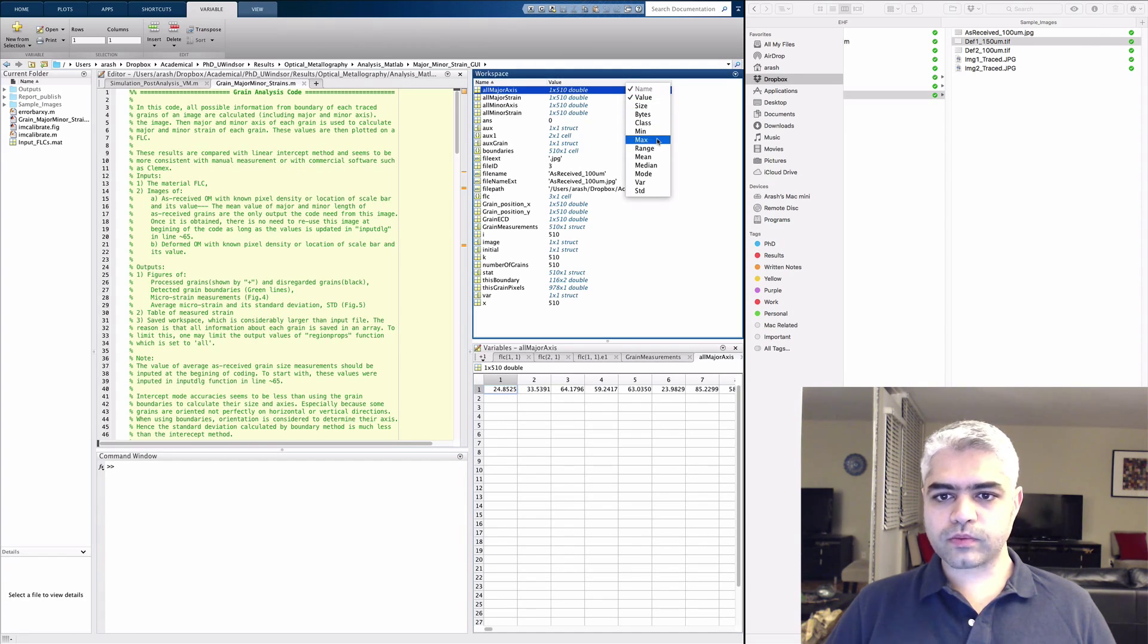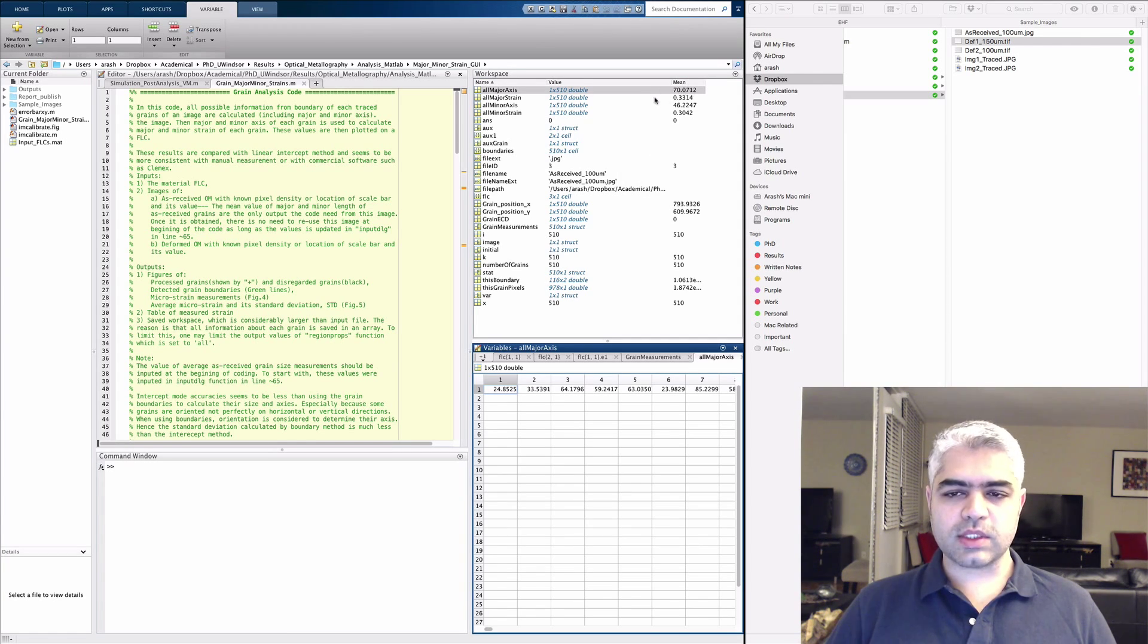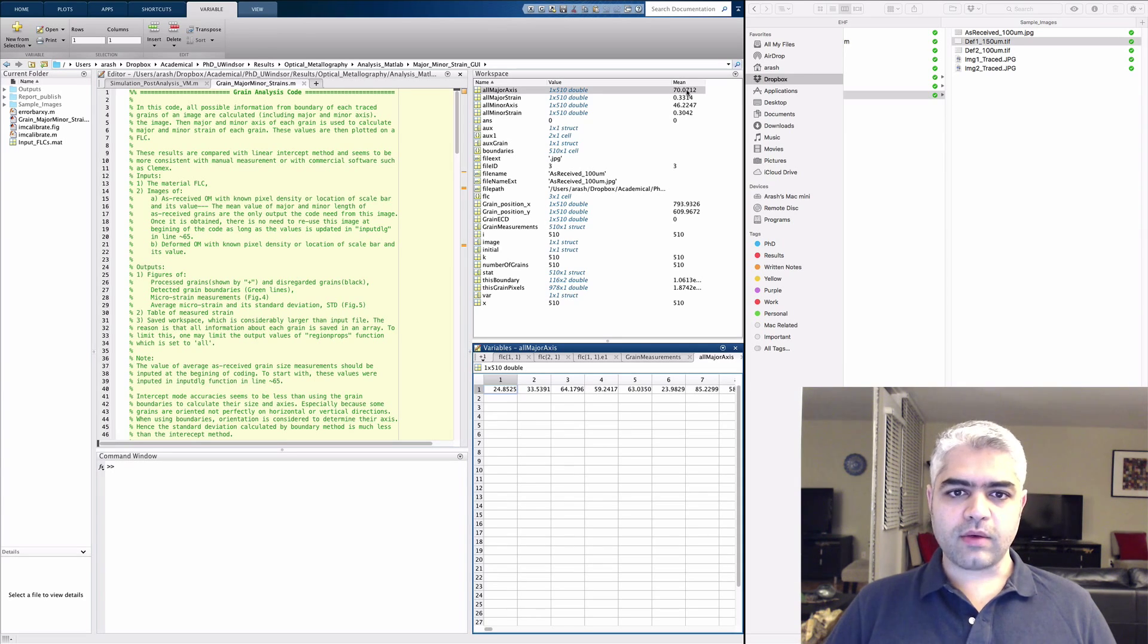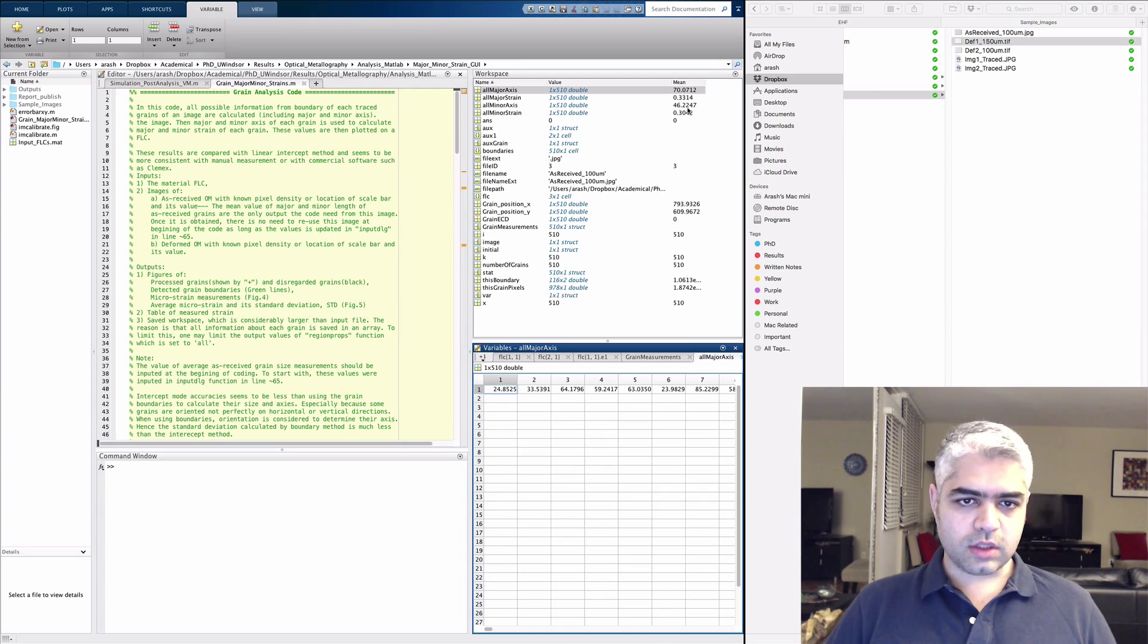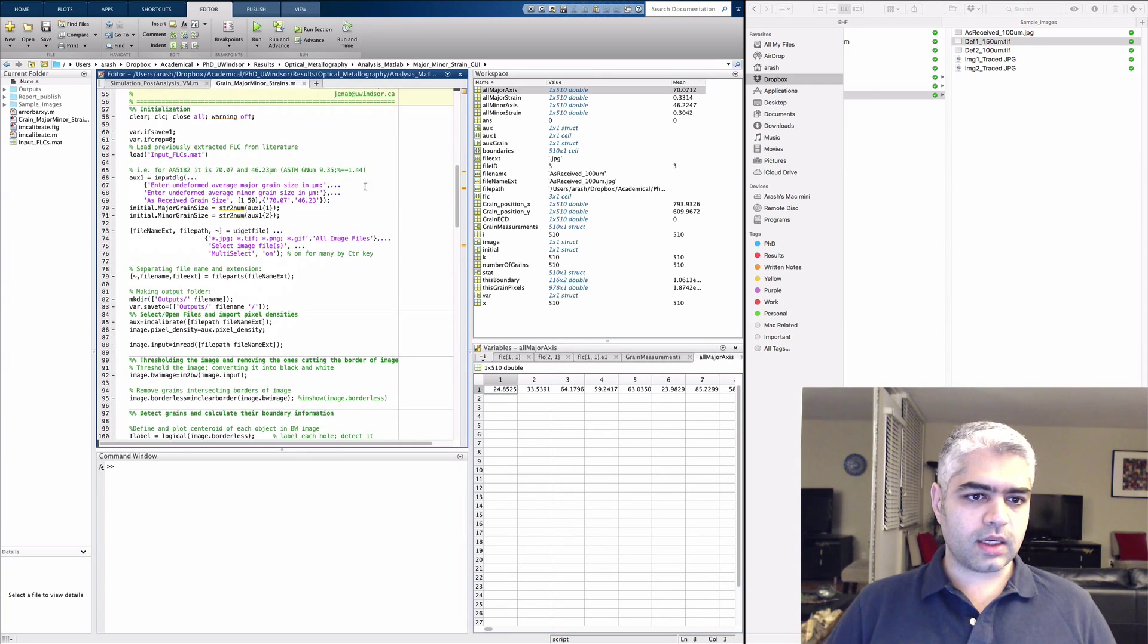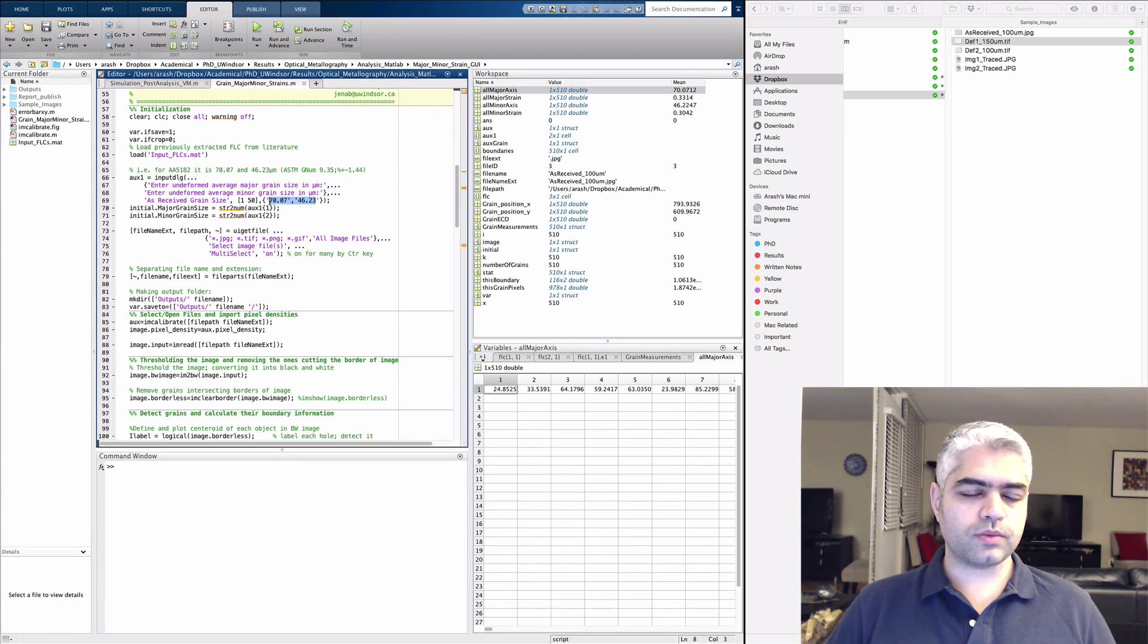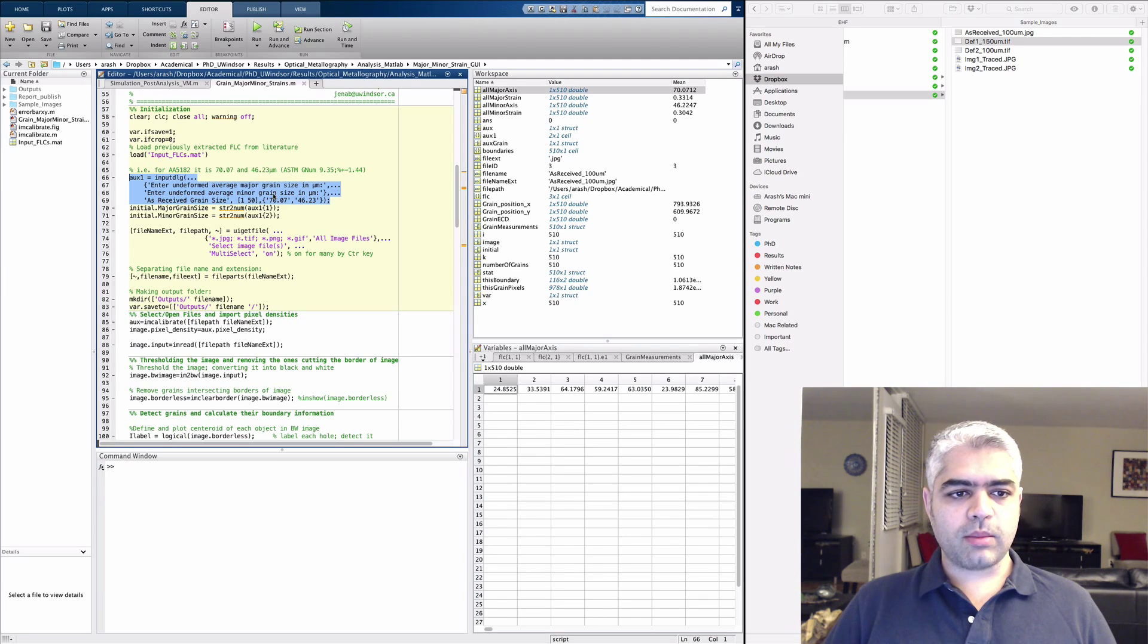You can see that the mean value for the all major axis was 717.07 and for the all minor axis is 46.22. So these are values that are used inside this initiation or inside this code. This is what you need to do at the beginning to have these values.